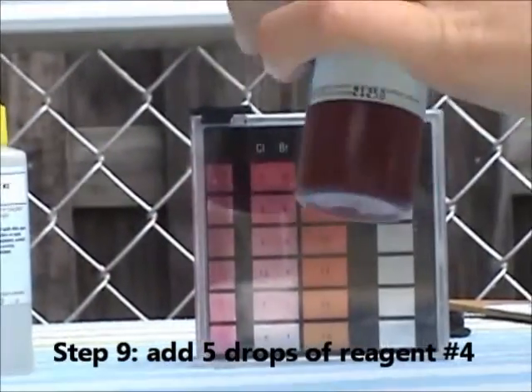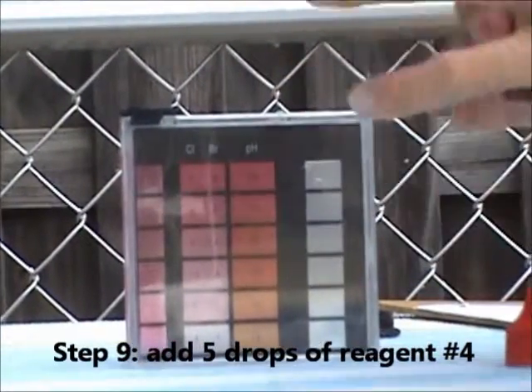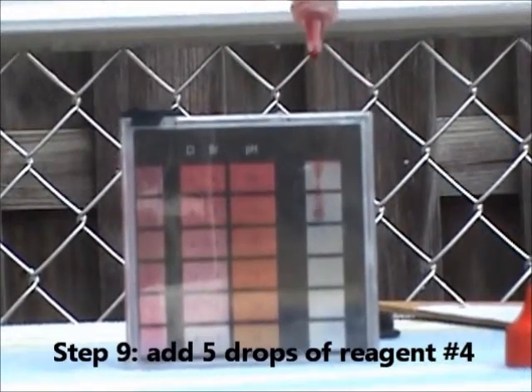Step number nine: add five drops of reagent number four into the large side of the comparator block this time.